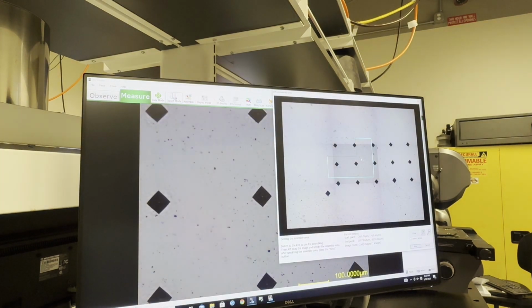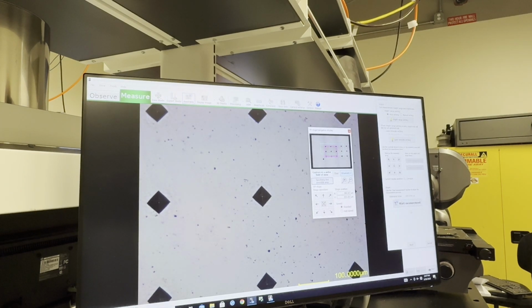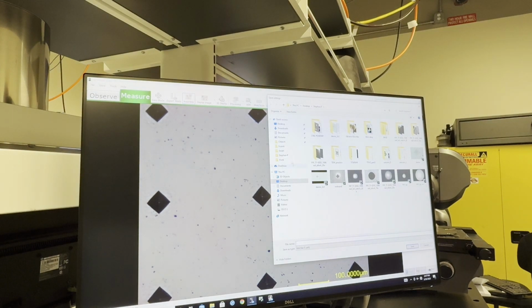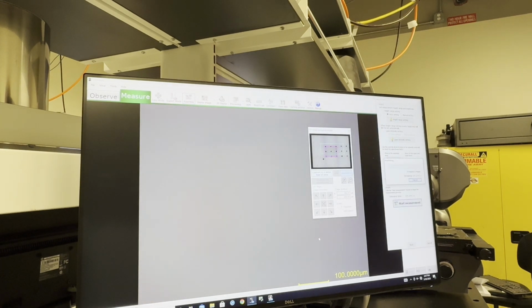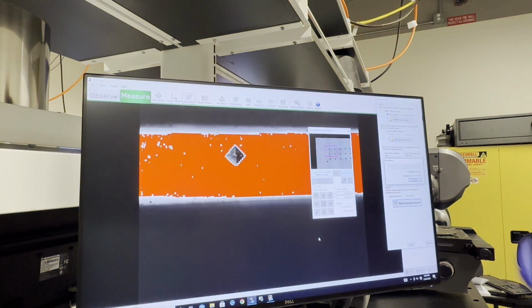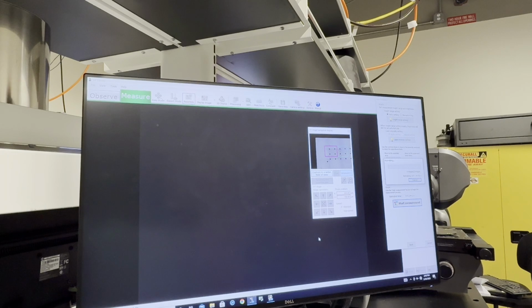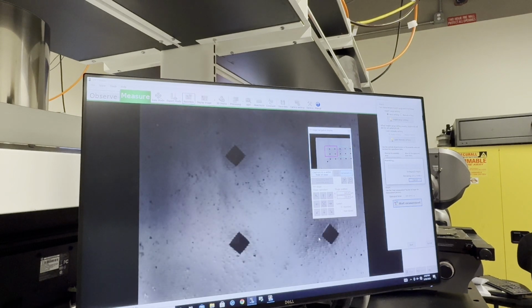You can now select the places you want to image. In this case, we're only going to do 2 images of the top left 8 indents. You can do much larger images depending on what you want to image. This will then ask you to save the stitch before it starts stitching images together. In most cases, you want to use the automatic settings, and you do not have to set the lower and upper positions. The reason you would want to zoom in closer than zooming out and taking an image of the whole grid is to get a much more detailed image.